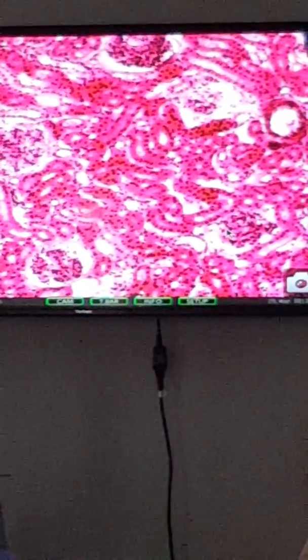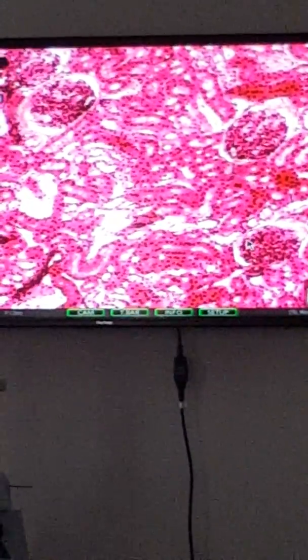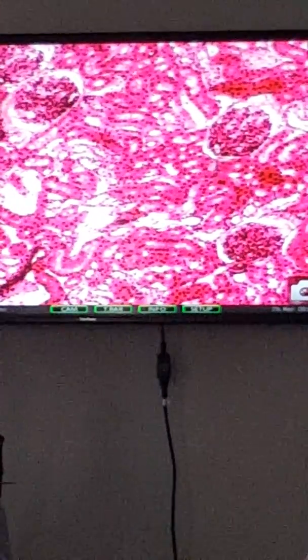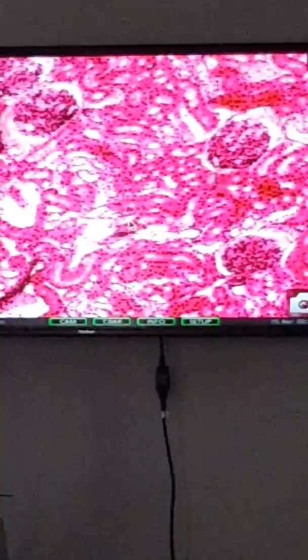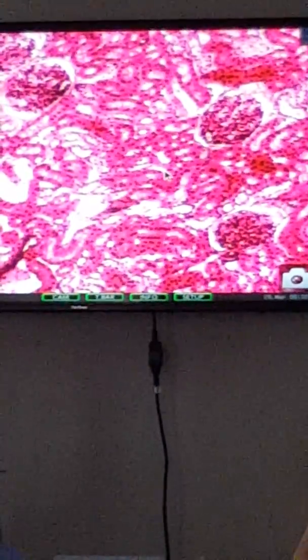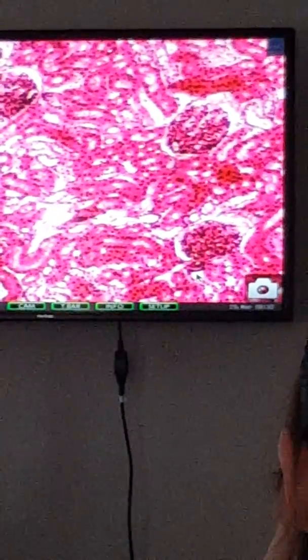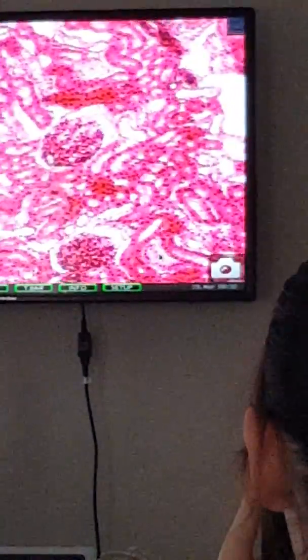First studying the tissue, it's nice just to see what it looks like in general. Now, most of what you're seeing here between the glomeruli are mostly PCTs, but you can have some DCTs. The PCTs here are a little bit darker staining. Oh, by the way, there's a good macula densa right there. You see that? Let's bring it up front and center.